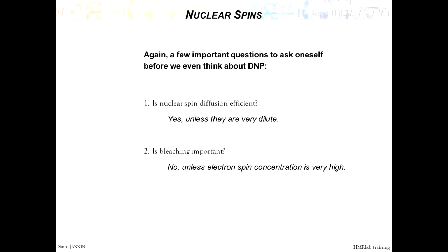Yes, there is an optimum that we find experimentally, and tomorrow I hope I have time to go all the way to the derivation of the thermal mixing equation, and there, with the equation you can see the trend. So you can see if you move this in that direction, the concentration, the T1, you can see how it goes. But to really quantitatively find the optimum by simulation, I wouldn't know how to do it.